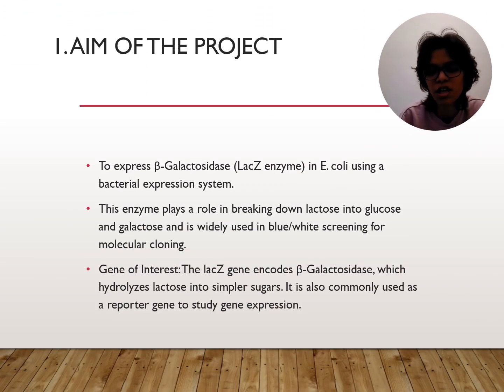The goal is to express beta-galactosidase enzyme in E. coli using a bacterial expression system. This enzyme plays a role in breaking down lactose into glucose and galactose and is widely used in blue-white screening for molecular cloning. The gene of interest which I have selected is the lacZ gene, which encodes beta-galactosidase, which hydrolyzes lactose into simpler sugars. It is commonly used as a reporter gene to study gene expression.